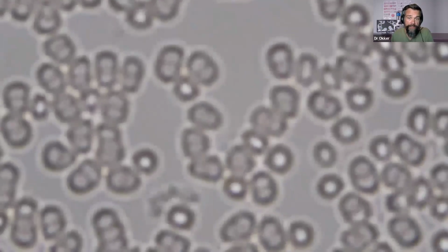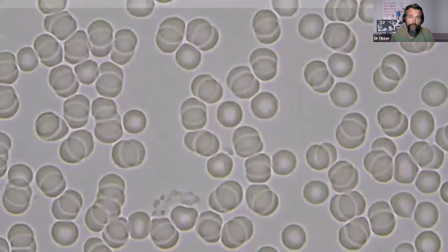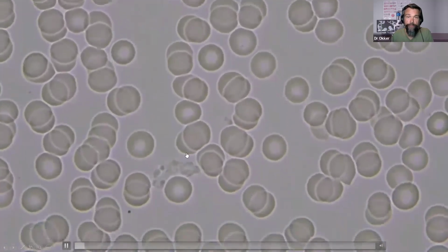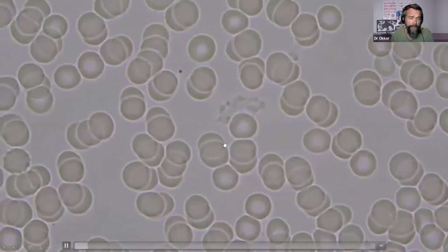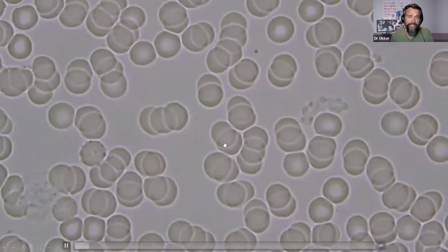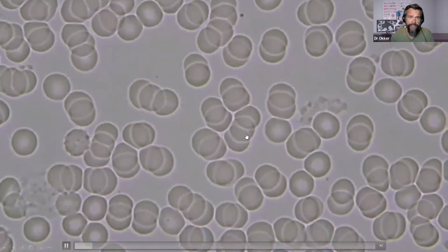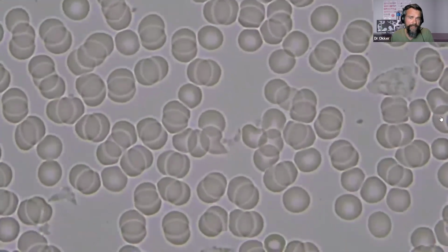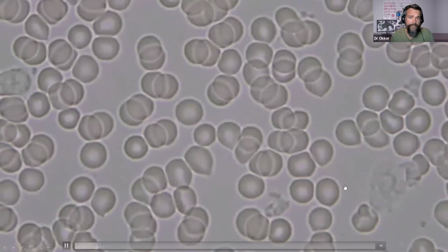So this is done in bright field initially when we start looking at the sample, and we're looking at the actual red blood cells there. The structure at the bottom of the screen here is a group of thrombocytes. So that's thrombocyte aggregation, platelets sticking together. You can also see the arrangement of the blood cells here. They're overlapping. They're not really lying next to each other on a single plane. They're rather sticky and kind of sticking together. And that in itself is an indication, there are a few things related to that.